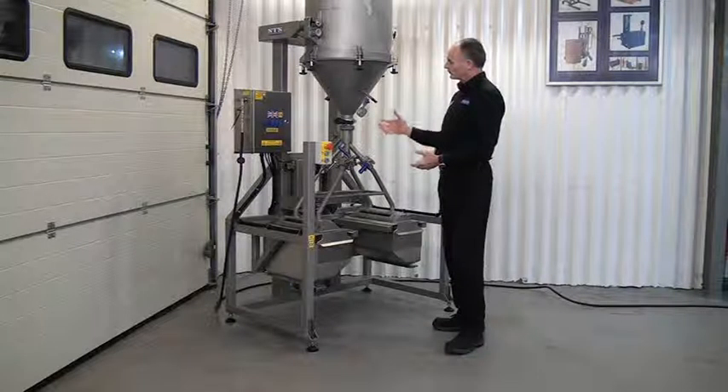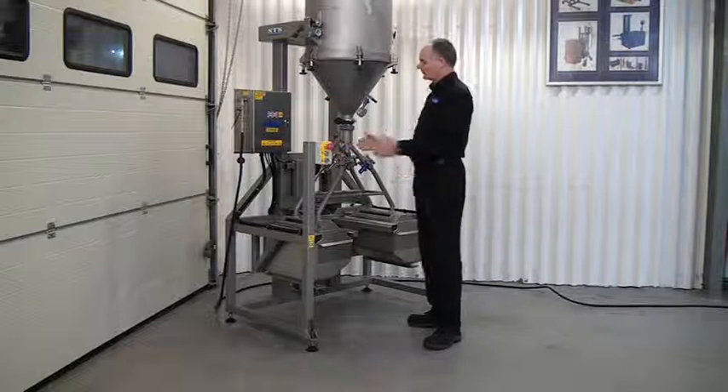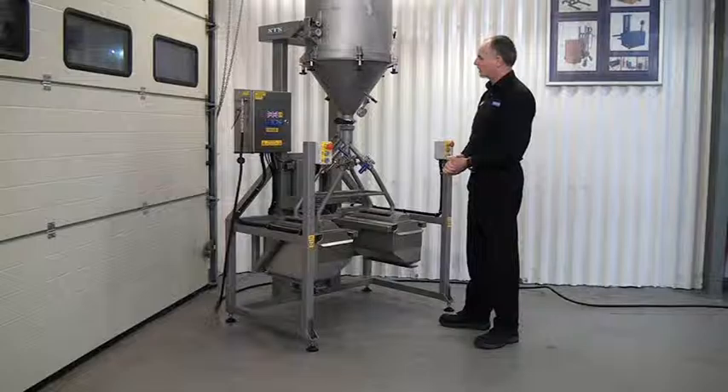We transfer the powder by opening the valve here. We have a number of quarter-turn valves so we can spread out an even flow of powder into the hoppers.